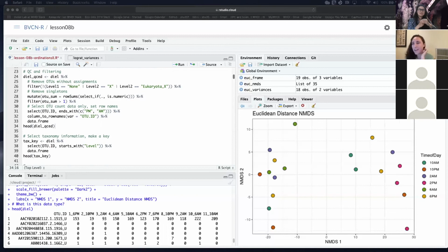What do you think? Yeah, it's constantly changing. I think relative abundance is fine for plotting, so I still use it a lot for that. But I never use it for statistics unless one of the transformations you're doing is a transformation of relative abundance data. For example, I think the Hellinger transformation uses relative abundance instead of absolute abundance. Oh, yeah. Okay. But in terms of which transformation, I think it always depends on what you want to do, and also the current knowledge, right? There's always something new, and it's almost good that there are more tools available.